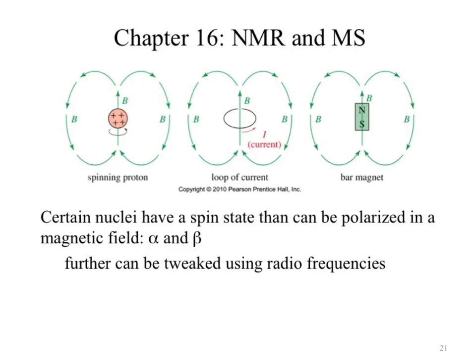So we can change the energy of the radio frequency to change what atoms we're potentially hitting, or interacting with. And what we can do is monitor the time lapse between those, which gives us some information, because that radio frequency has to be able to make it into the magnet, or into our tiny little atoms. So if there's a bunch of stuff in the way, we have to use a stronger and stronger radio frequency. Well, what stuff could possibly get in the way?